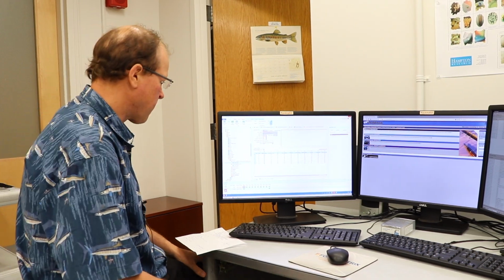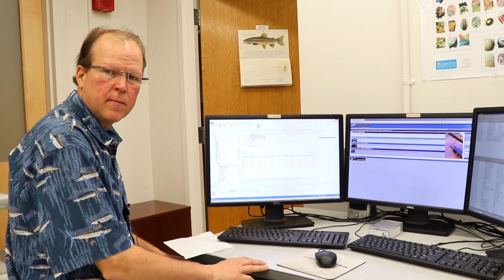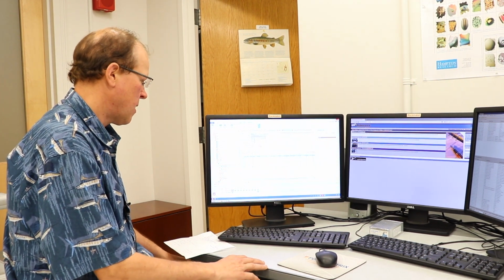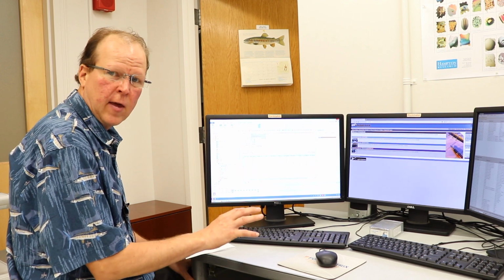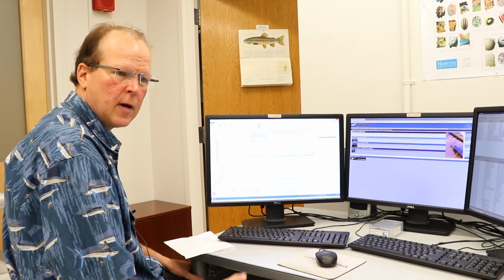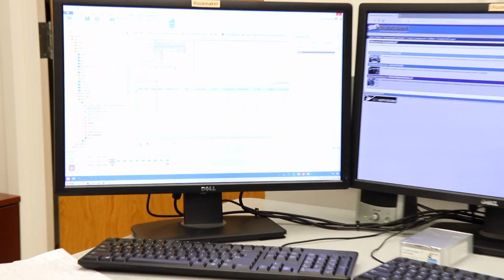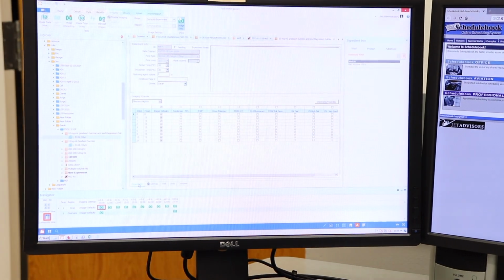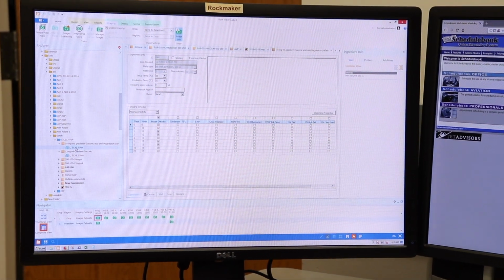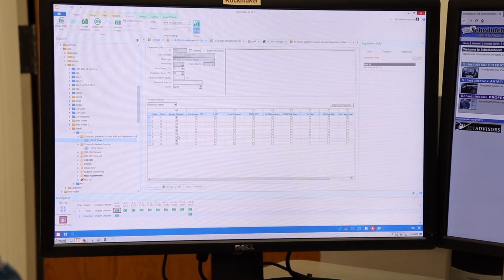Okay, so in the hang drop experiment, initially at time 0, the imager will take an overview picture of the drop and then do an automatic drop location. Then it will take a high-resolution picture of where it thinks the drop is based on that drop location algorithm. What you want to do soon after that, preferably the same day or the next day, is go in and manually inspect and adjust the automatic drop location. So you'll find your plate, and this is an example I'm using here. This is our experimental setup.